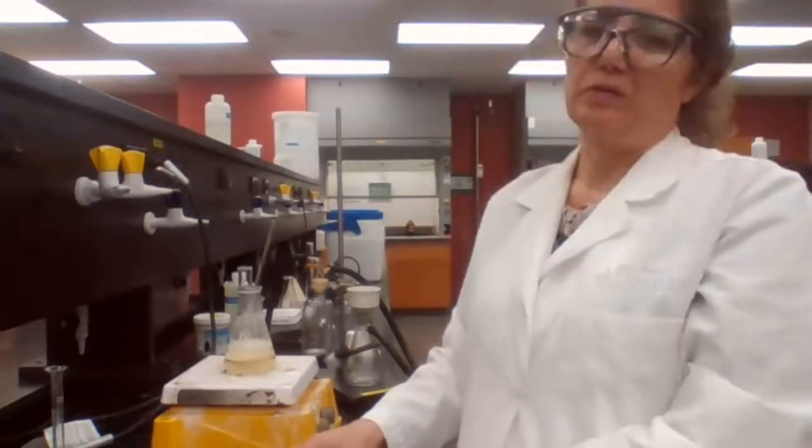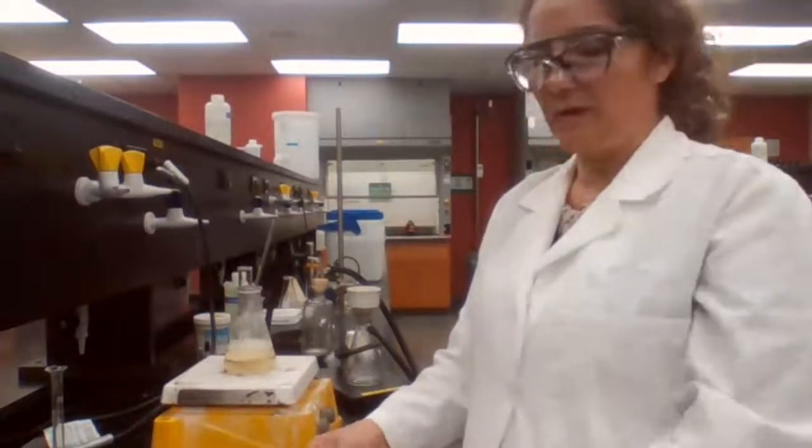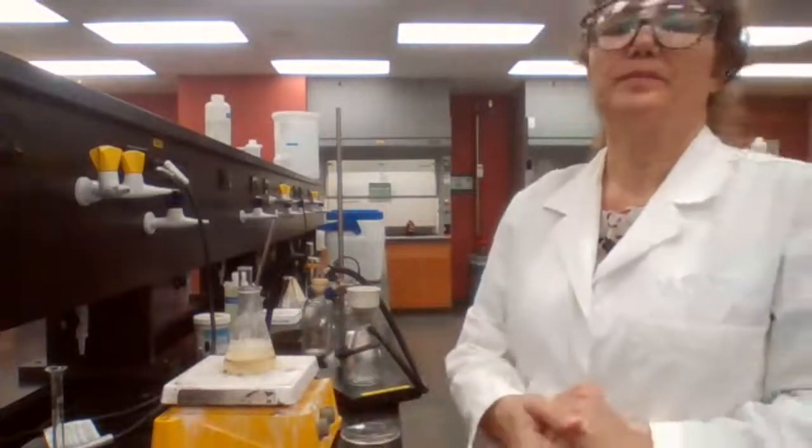The crude product, no. We don't need the crude product. We just need the mass for the final product after the recrystallization, after drying of the sample. You're welcome.